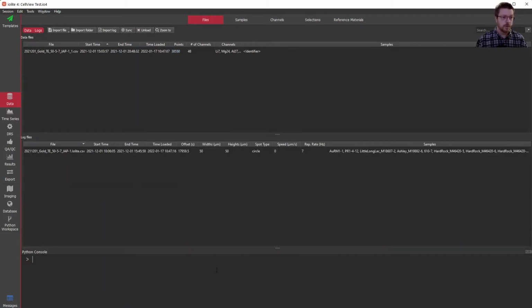So in Python, we can get the coordinates of a selection by doing something like this. So if I go data.selectionGroup, and I take a group and I get a selection from that group, and then I do a property, I can do coords, and this is just now here a tuple of QPointFs. So these are the xy coordinates of that selection in micrometers in cell space.